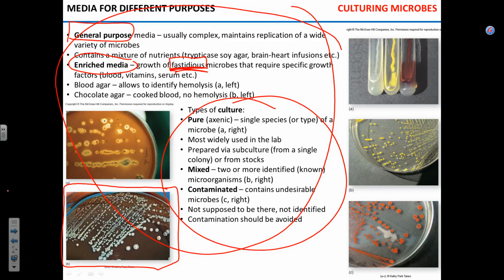But what we know is it grows excellent on so-called chocolate agar. It doesn't have any chocolate. The sheep blood is heated up, pretty much cooked, and is added into the regular TSA. So it gives it a chocolate color. And you can see the Neisseria colonies in this particular example. Okay? In many cases, so, okay, what is so special about the blood?